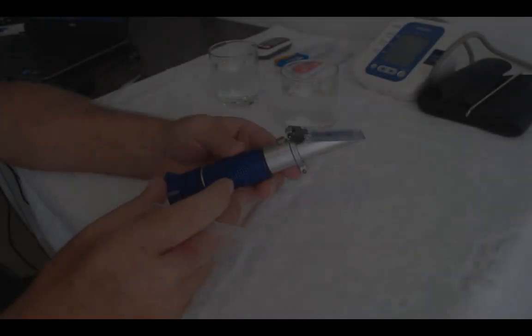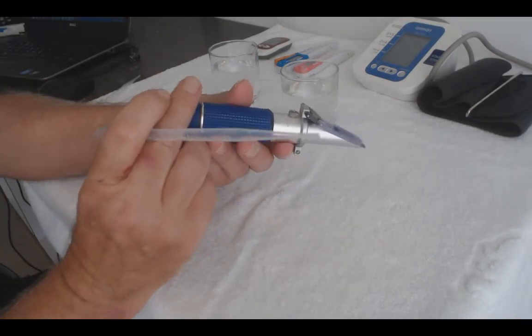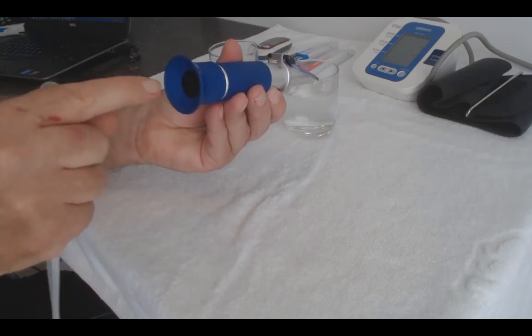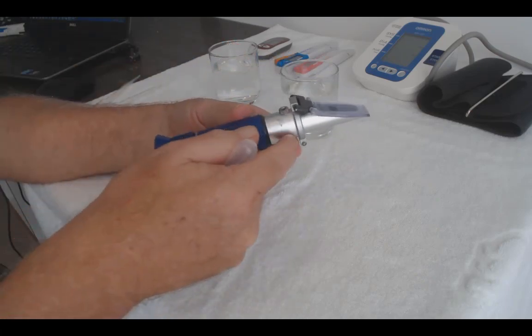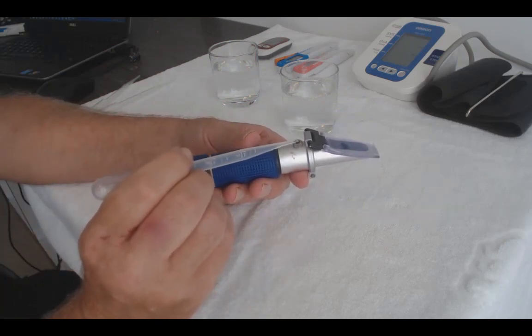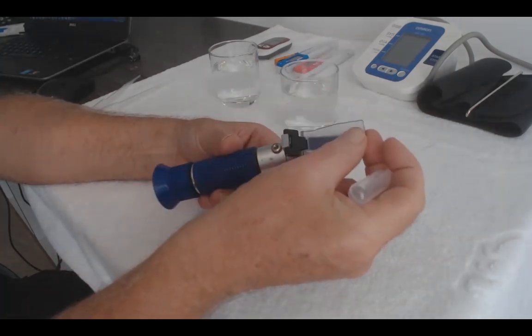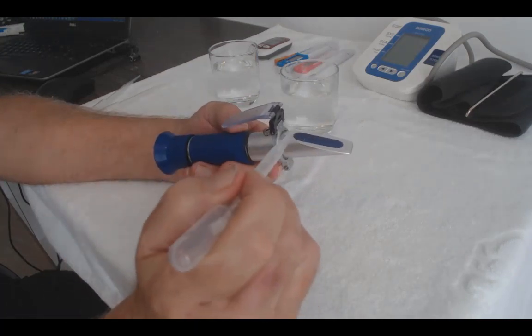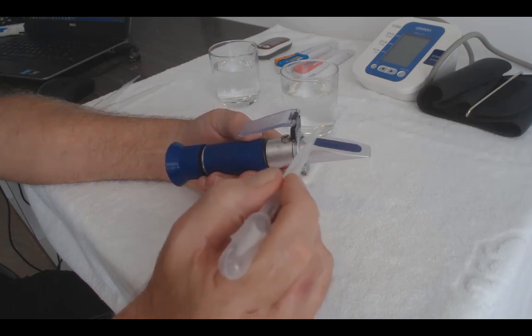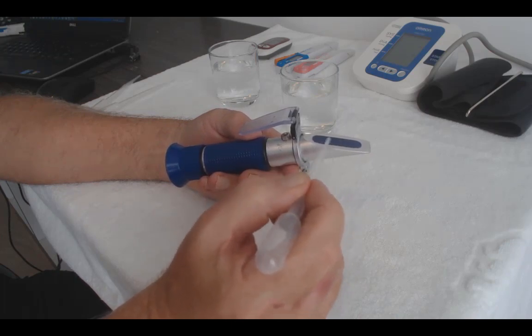Okay, we have the refractometer here, which is a very simple tool. There's not a lot to it. You can see at the end there's a little focus glass here, which you can just turn and focus once you look inside here. You've got the base. We have a calibration little screw here, which is what we use to calibrate, which I'll be showing you in a second. We have the little plastic cover slide here. Basically that covers the sample, and the sample sits on this plate here. Now it's a refractometer, so what we're talking about here is light refracting through the particles that are in solution.